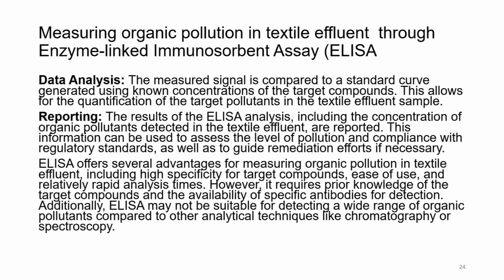The results of the ELISA analysis, including the concentration of organic pollutants detected in the textile effluent, are reported. This information can be used to assess the level of pollution and compliance with the regulatory standards, as well as to guide remediation efforts if necessary.